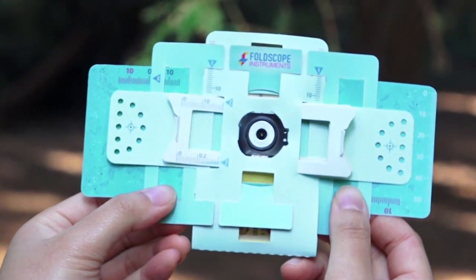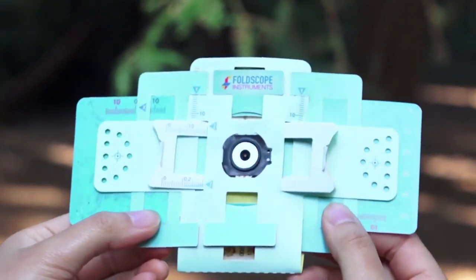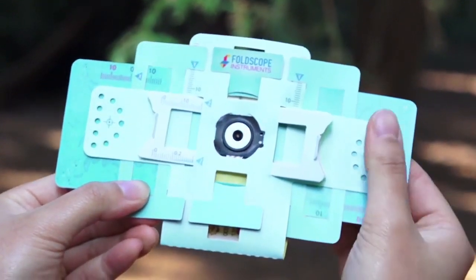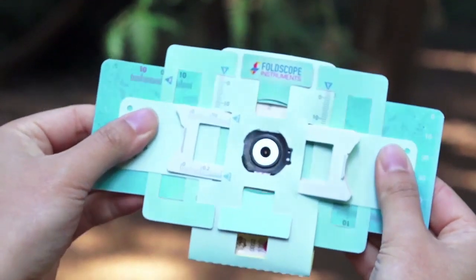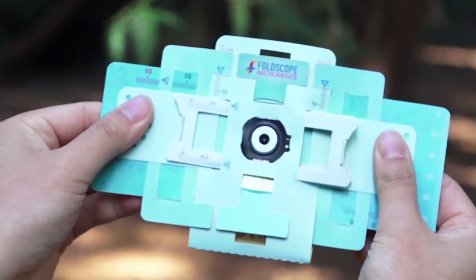Now that you've inserted your sample slide in your foldscope, let's start exploring. Let me show you how to hold your foldscope. You're going to place your thumbs over the half moon shapes on both sides like this. That way you can move around your samples easily like this.